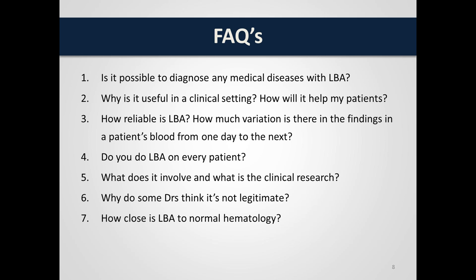Many of the anomalies that we view as being significant in live blood are actually disregarded in conventional hematology because they're seen as part of the staining process or byproducts of the staining process. Whereas in live blood analysis, because the blood is collected from the finger and placed immediately on a slide and viewed straight away under the microscope under high magnification, and absolutely nothing is added to the blood, it is viewed exactly like it is in the body.